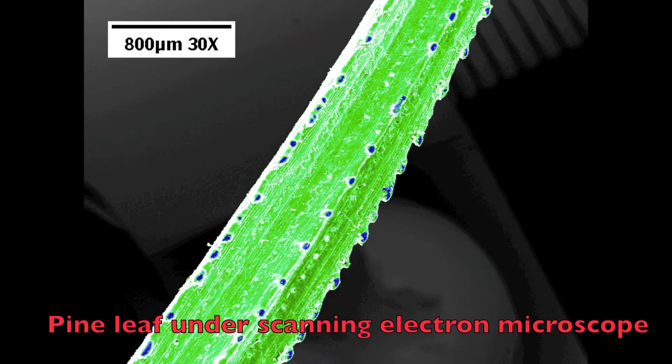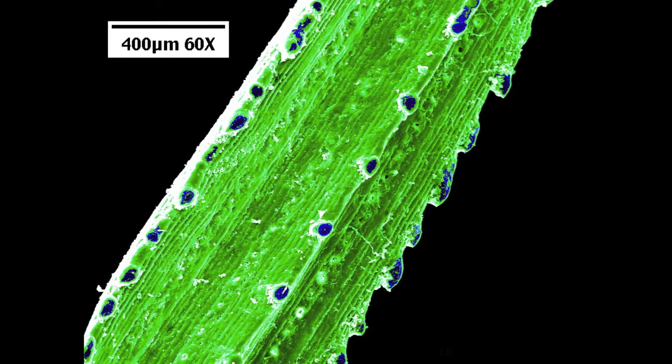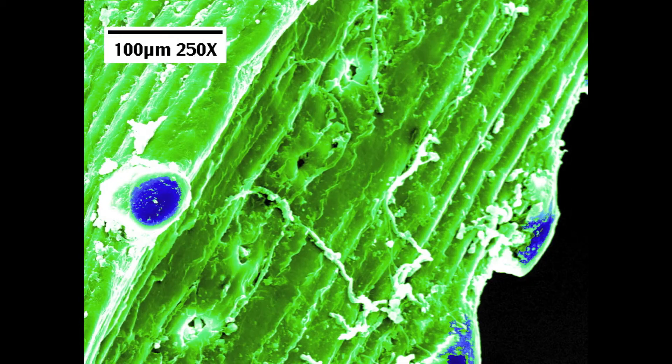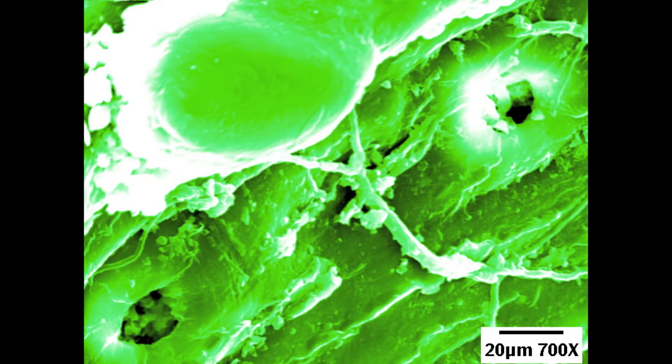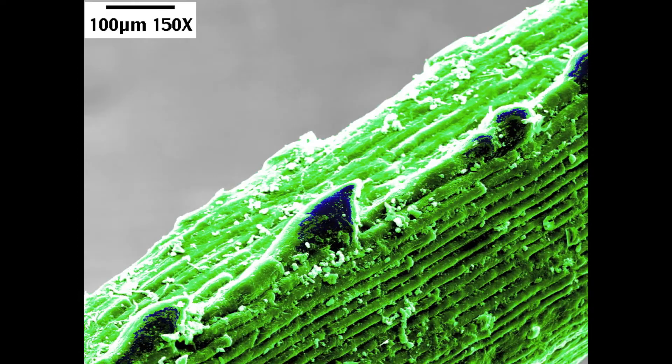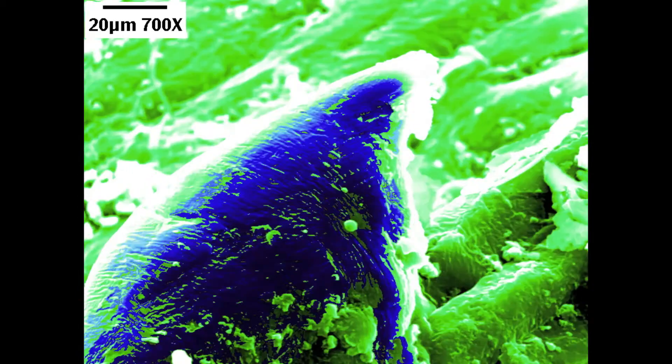So let's zoom in now on one of these pine needles. And see these little blue dots? Remember I told you that they had serrated edges? Well these are the little structures that let you feel the serrations as you run your fingers up and down the length of the pine needle. There's some controversy as to whether these are made of calcite or they're made of silica. But they're very hard and they give serrations. Now these little holes that you see, those are the stomata that allow for gas exchange inside and outside the leaf. Now we'll do another zoom series here. And again, pay attention to these serrations. These sharp little hard mineral bodies that are found up and down the length of the pine needle. And the purpose of these structures is not yet completely known, but they're very hard and they're very interesting.